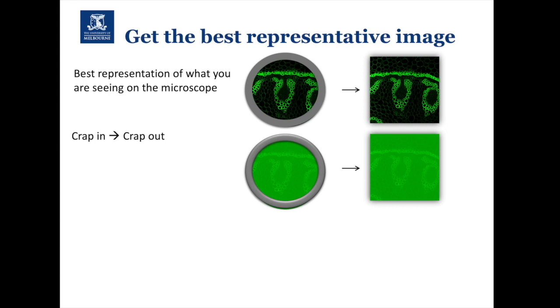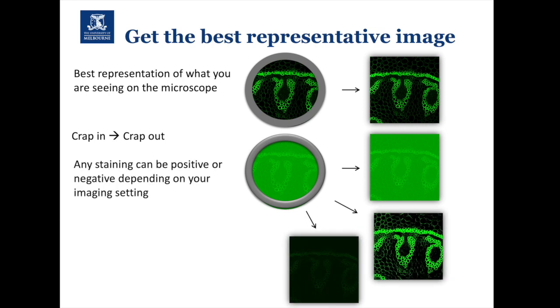Now the rule is if you put crap in, you should get crap out. Unfortunately, if you know what you're doing, or conversely don't know what you're doing with microscopy setups, you can make data that looks pretty crap look pretty good, or data that looks pretty good look pretty crap.